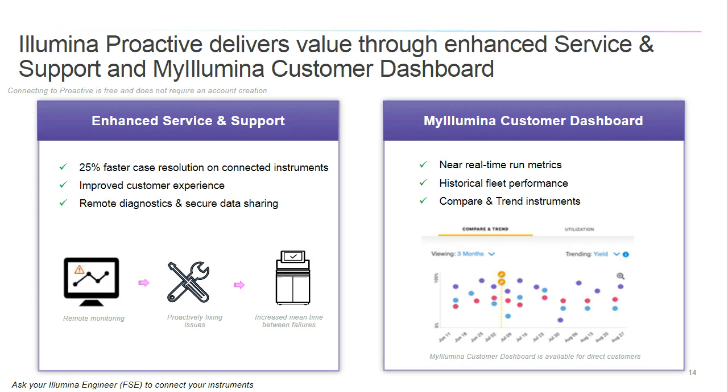Additionally, we have algorithms monitoring instrument performance metrics that are designed to detect potential issues before they impact sequencing runs, which prevents sequencing issues and instrument downtime.